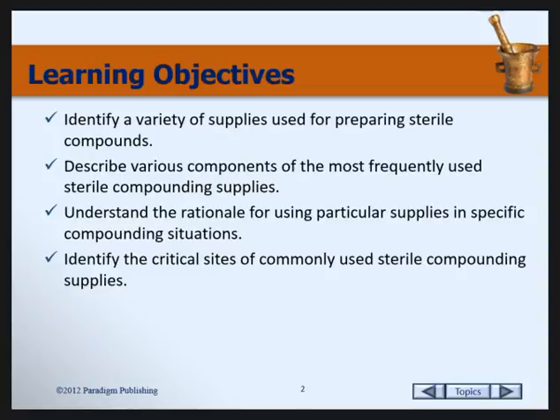Identify a variety of supplies used for preparing sterile compounds. Describe various components of the most frequently used sterile compounding supplies. Understand the rationale for using particular supplies in specific compounding situations. Identify the critical sites of commonly used sterile compounding supplies.